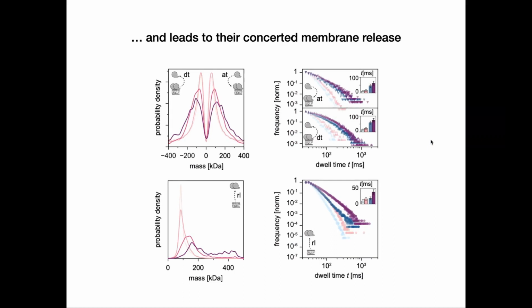Also, the lifetimes of MinDE species are always higher as compared to the corresponding MinD alone.